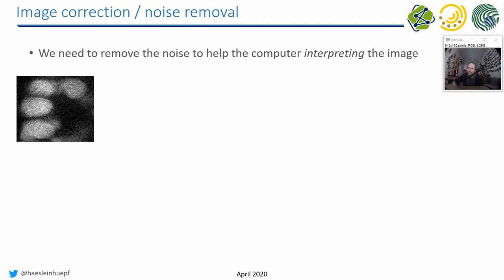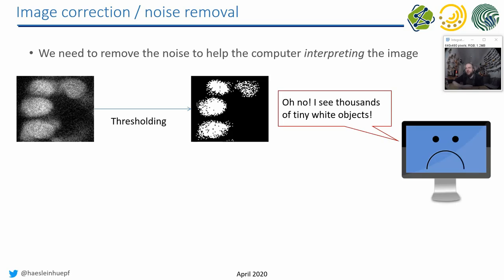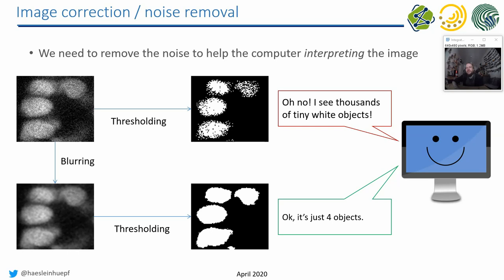So why do we have to remove noise in order to work with images further? If you take an image as it comes out of the microscope and apply an algorithm called thresholding, the computer may think there are thousands of tiny white objects in the image. But if we blur the image first - which is a step allowing us to remove noise - and apply thresholding afterwards, then the computer may suddenly see the four objects we were also perceiving. This is the necessary step we have to do in order to do proper image segmentation and get proper cell counts out of images.